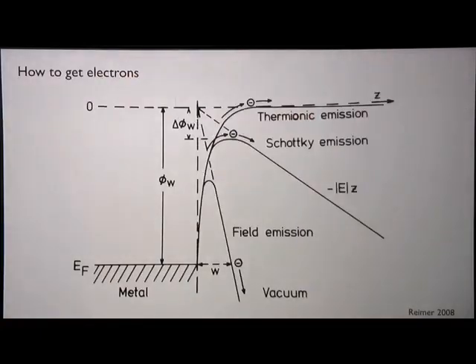that brief aside, let's talk about the source. There are really two and a half kinds of sources in an electron microscope. The vocabulary, you talk about three different kinds: field emission, Schottky emission, and thermionic emission. But really, there's a continuum between these three. But I'm going to explain each of them in detail.